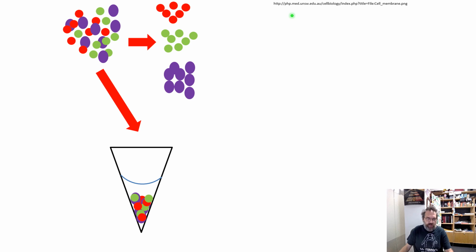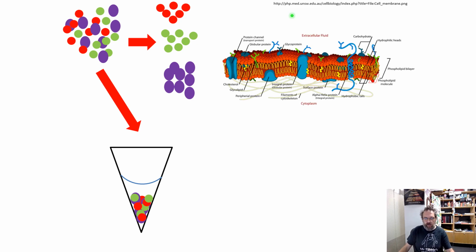Now, when you take these proteoforms out of their native environment, if they are just in water with no buffer salts or other molecules in there, they typically just fall out of solution and form an aggregate at the bottom of your tube. The problem with this is once they're aggregated, you can't separate them. You can't move them around in liquid to actually get them to separate. So what you then need to do, this again is shown in the bilayer membrane.